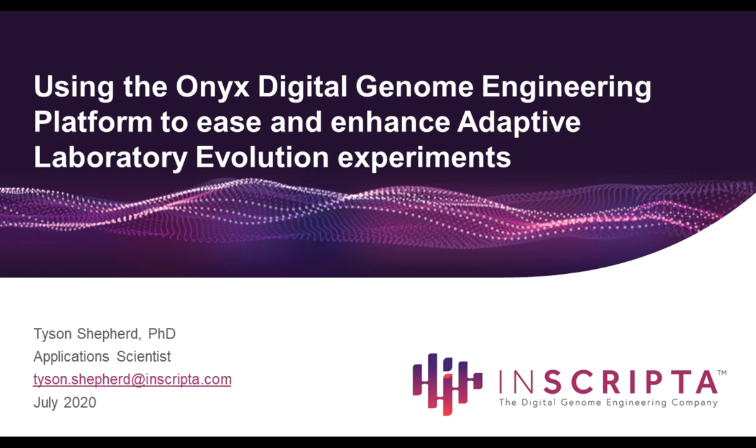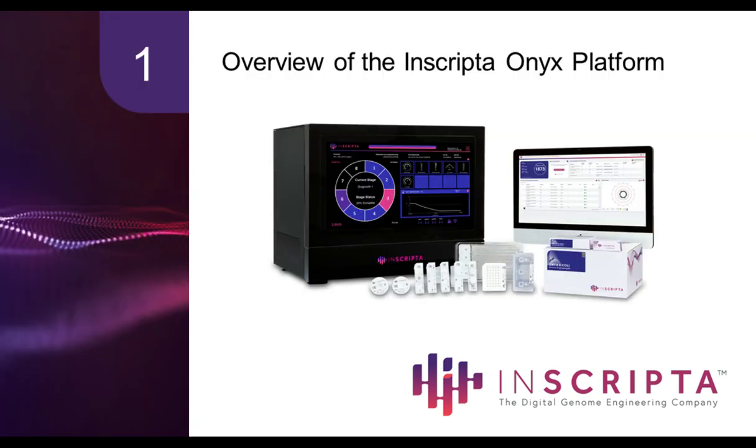I see a lot of potential for these impacting. As you'll see, it's a little like there's a thesis in every run of the experiment, and we're really bringing this to all the laboratories. In my presentation, I'll be going over the platform at the start, but then also showing an application of this in adaptive laboratory evolution and how we've recapitulated these libraries.